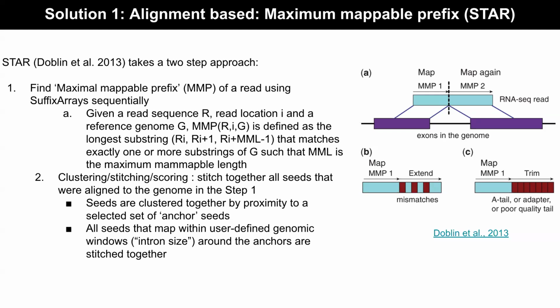It's regularly updated, which means that this is bootstrapped in a fashion, right? So you start with 10 different donors who submitted their data. We ran these kinds of algorithms. We came up with one possible structure of what the isoform is. So you're making a database of isoforms. This is isoform 1, isoform 2, isoform 3. Okay, now this is from 10 different patients.